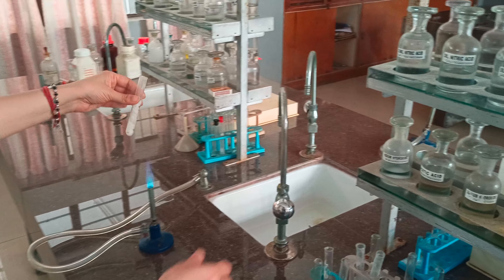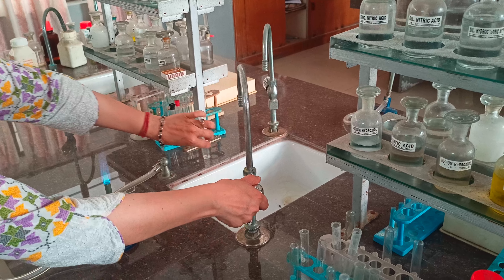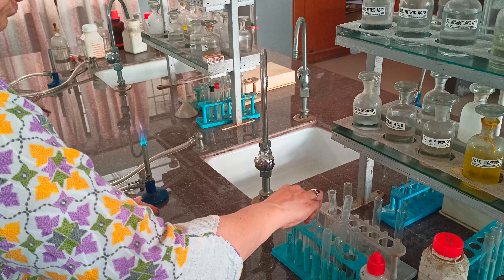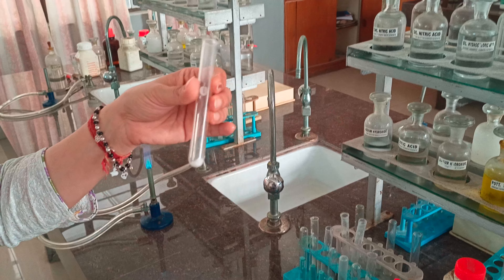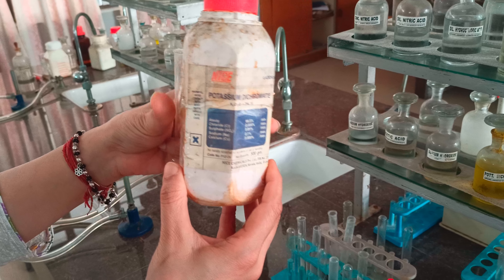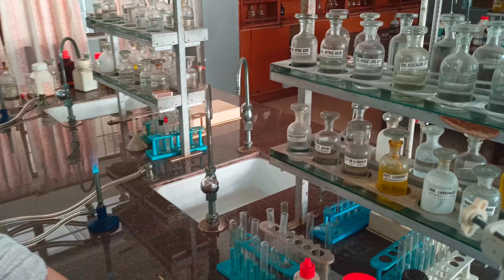This confirms it is chloride. We have to confirm the chloride ion, so we will perform the chromyl chloride test. This is the chromyl chloride test using potassium dichromate. We will take the salt in a dry test tube.